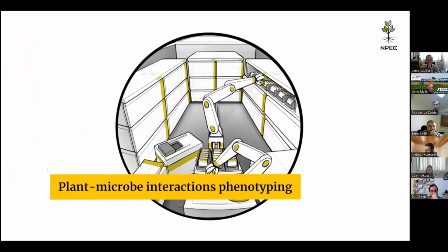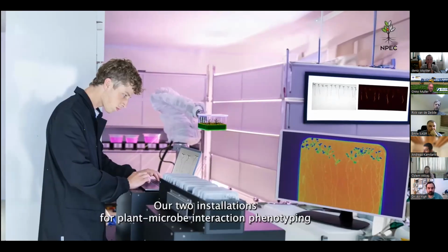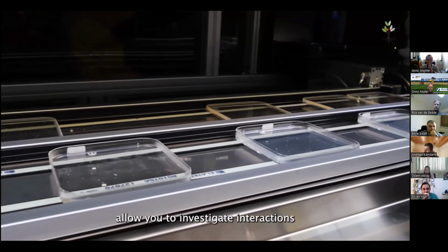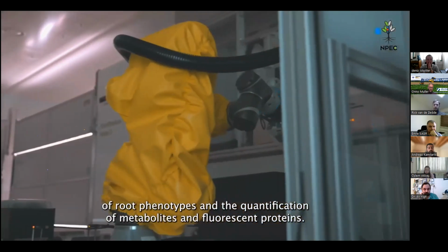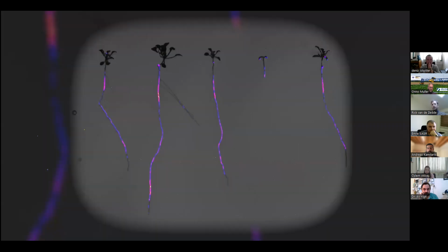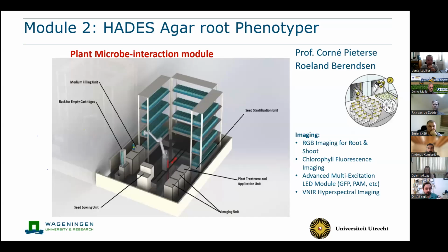This one I'll zoom in a bit more. So this is a small chamber where there are agar plates automatically filled and also sown with seeds. Where the first germination effects of your root is visualized by imaging. And all kinds of treatments can be added, like this one, to figure out how these roots actually evolve over time and how different treatments and controls are measured by cameras. So it's definitely image driven. And that's called Hades. So I'm going to focus on Hades.